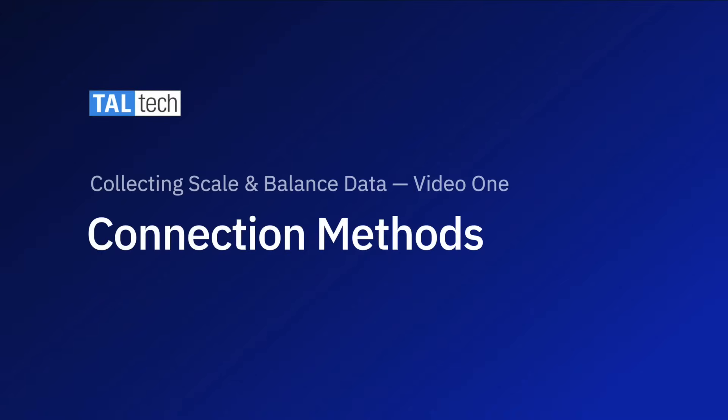In this video, I'm going to discuss the different ways to physically connect an electronic scale or laboratory balance to a PC.